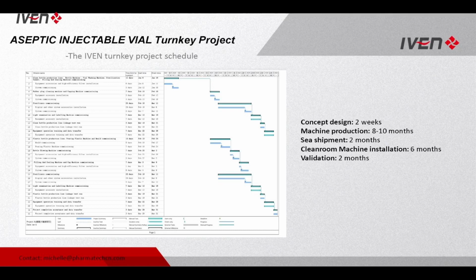Then we will see our project design and main process equipment for the injectable line. Before we start the design and after we sign the contract, we will give the detailed schedule for our Iven turnkey project, like how many days it will take to do the concept design, how many months we need for machine production, how many months for the shipment, and how many months we need to do the clean room installation and validation. So we will give you the detailed schedule, to let you feel more confident about your project's time control.